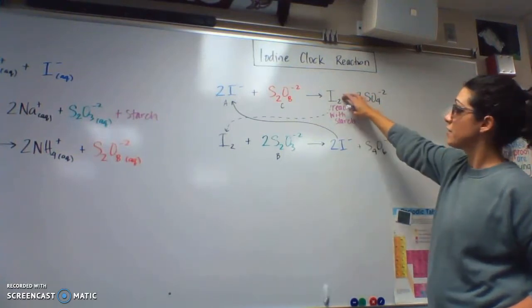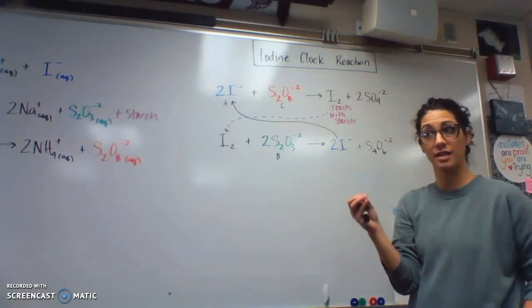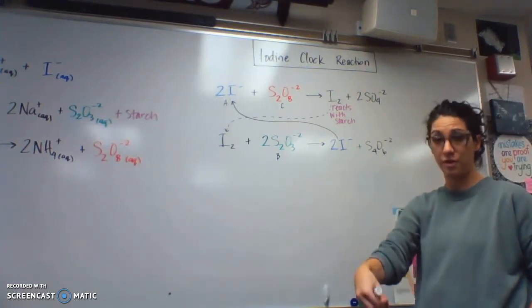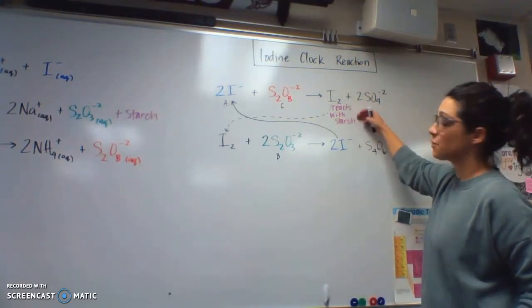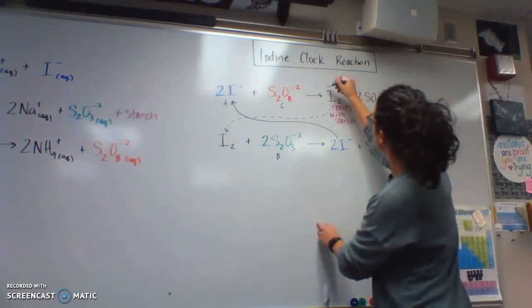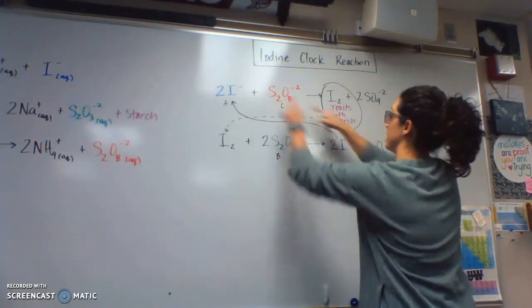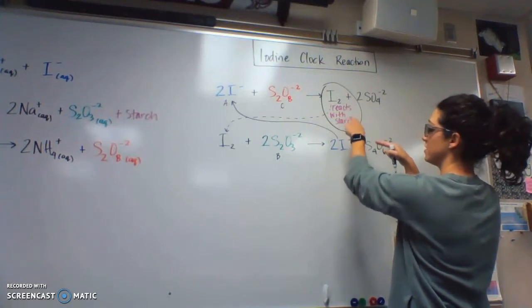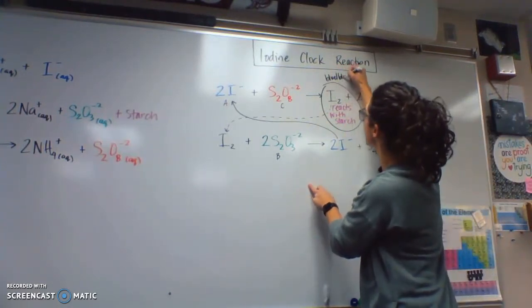Iodine will react with starch, like in a starch test you may have done in bio. Since the starch was in B, when A and C are added you get a blue-black solution.